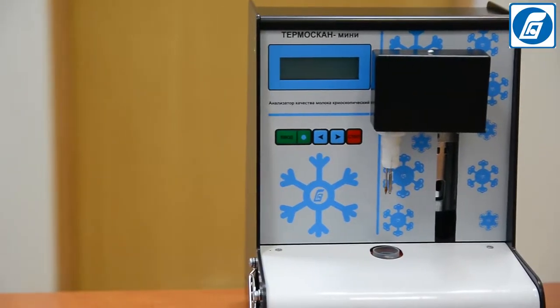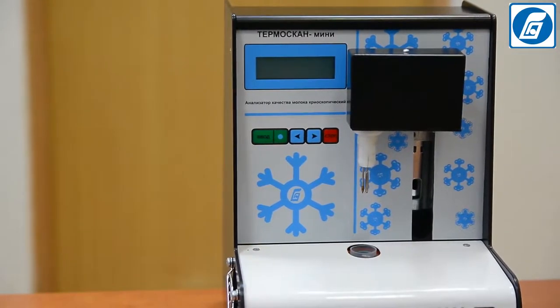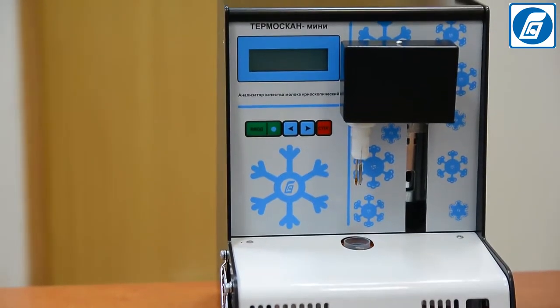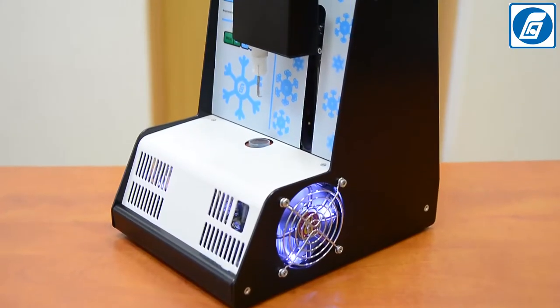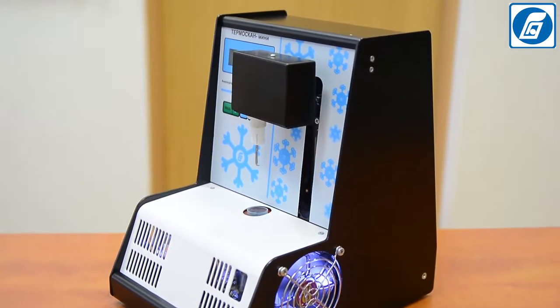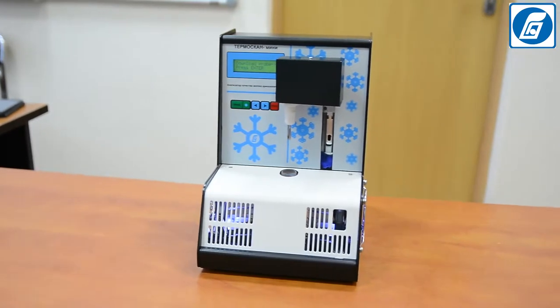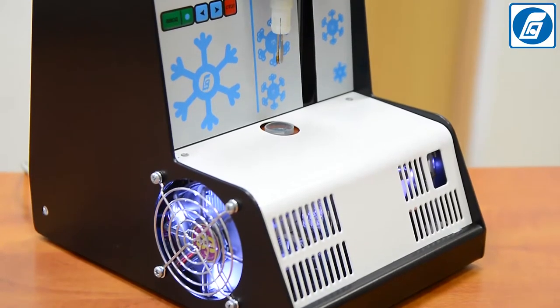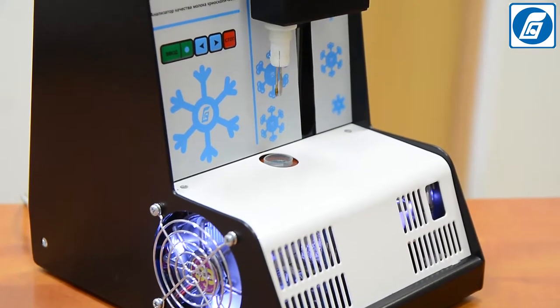We are glad to introduce the newest model among the cryoscopes available today — Temascan Mini, produced by Sibagropribor. Key advantages of our product: suitable for raw and processed milk, high accuracy of measurement, simple sample preparation, small consumption of milk for samples, and reliability.